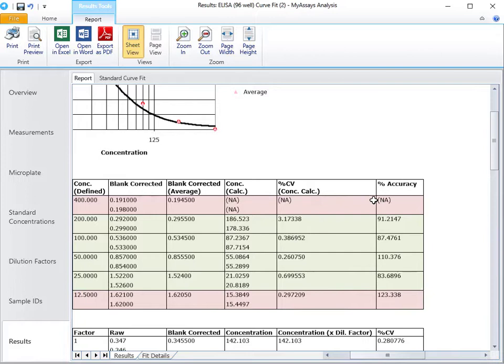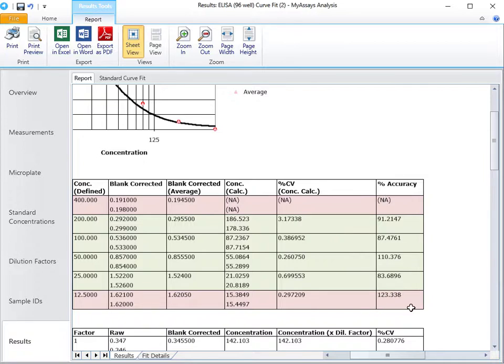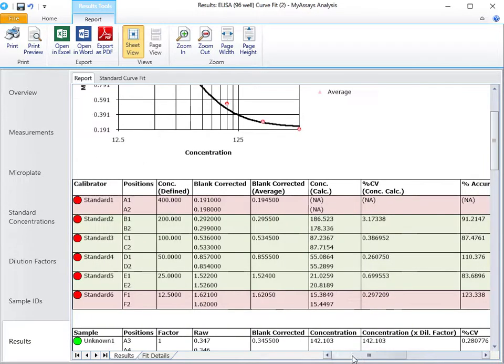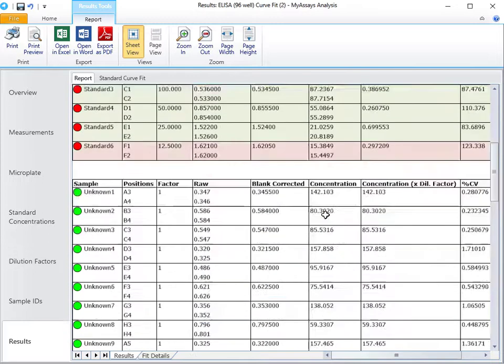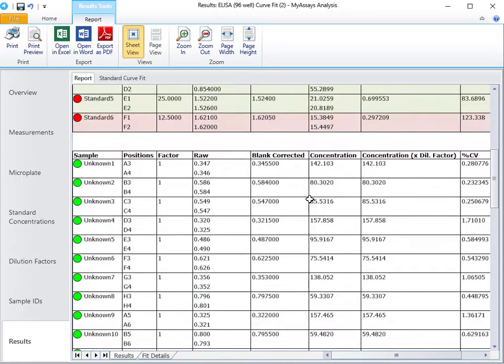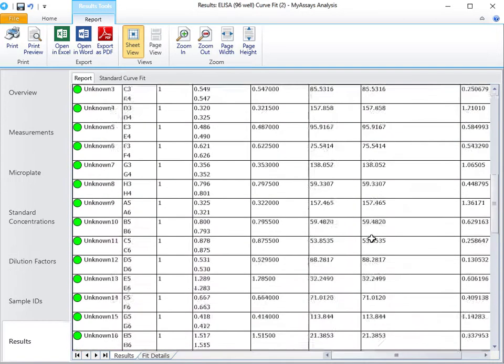Standards with percent CV and accuracy less than 20% are highlighted in green, and those with percent CV or percent accuracy greater than 20 are highlighted in red. Below the curve data table, the sample table displays the results of unknown and control samples.